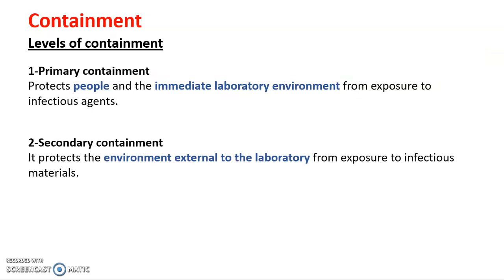There are two levels of containment. In primary containment, the main focus is to protect the person who is working with the infectious agent and the immediate laboratory environment from exposure. In secondary containment, the focus is more expanded — it also includes protecting the external environment outside the laboratory. So in secondary containment, we protect both the worker and the immediate lab environment, as well as the external environment.